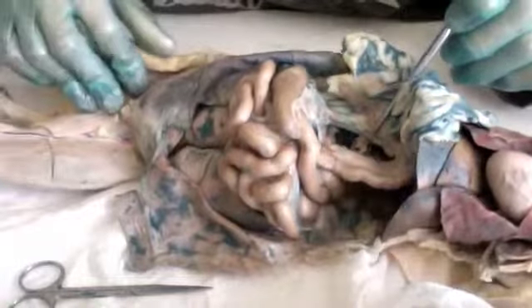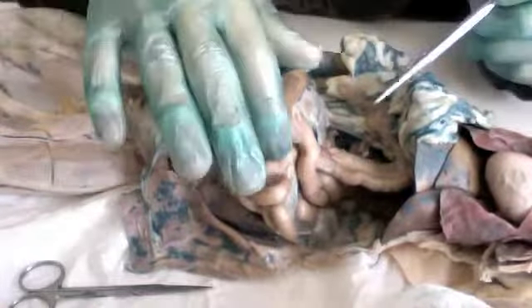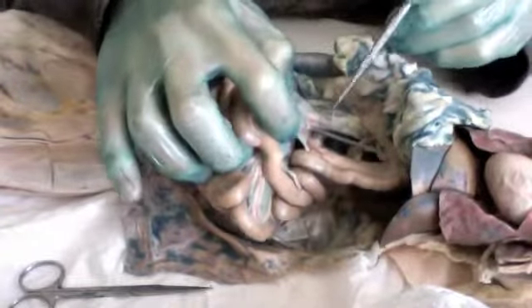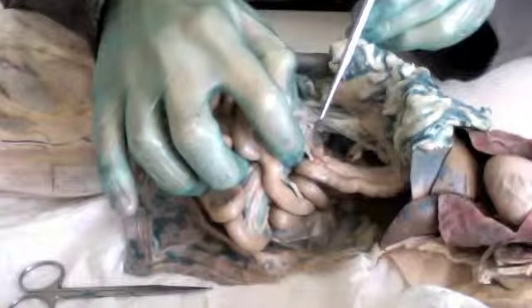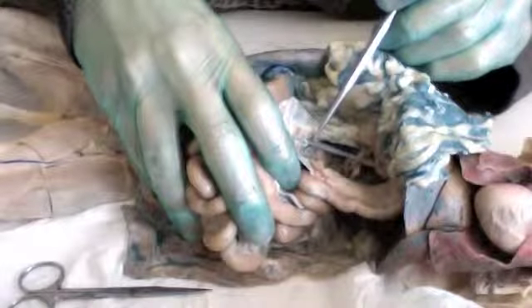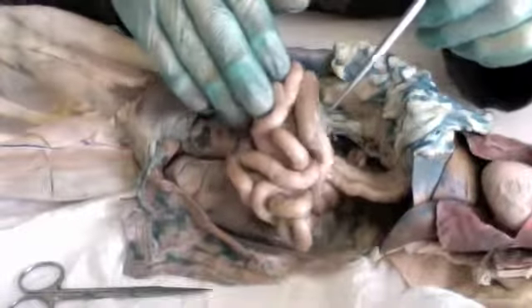Just making sure you can see this. Hepatic portal vein, gastrosplenic vein. And then as we move down here, we have the superior mesenteric vein, which is here, which is the lower region of it as it gets smaller. And then that branches off and turns into the inferior mesenteric veins, which are very easily displayed and I think look rather interesting. And all right here.